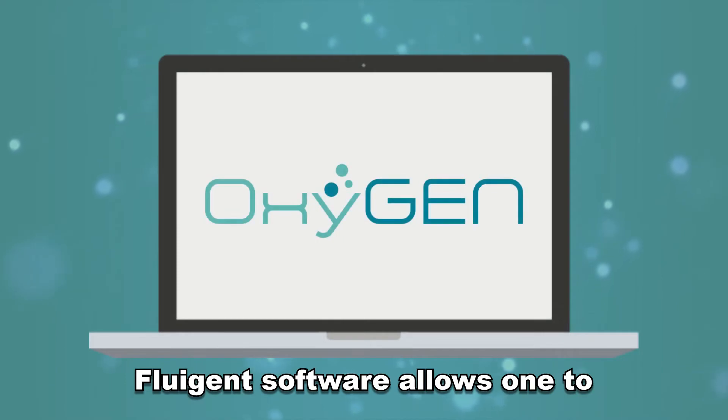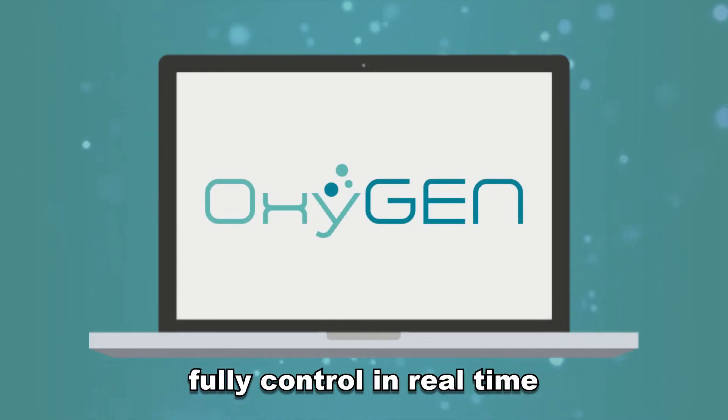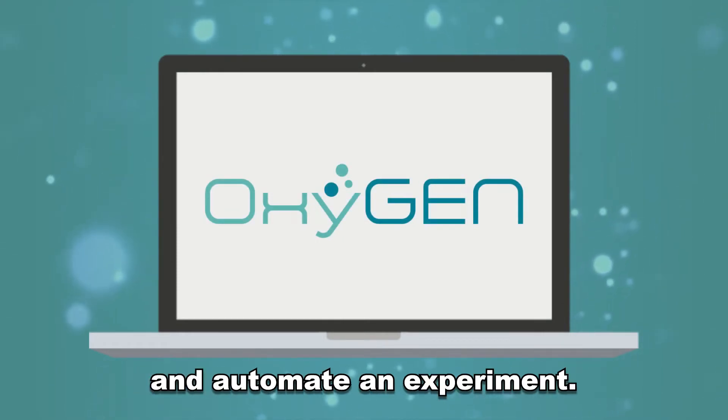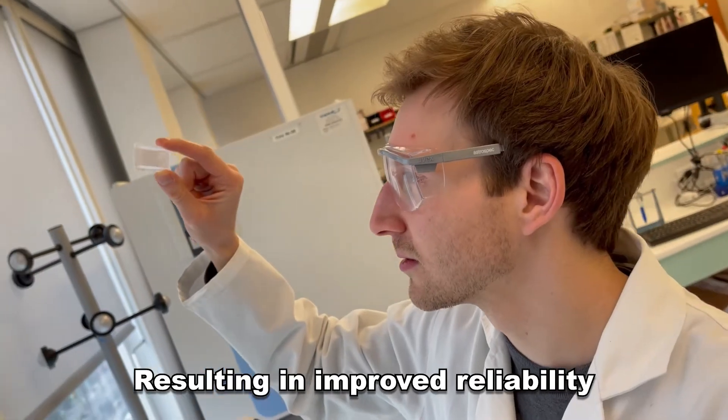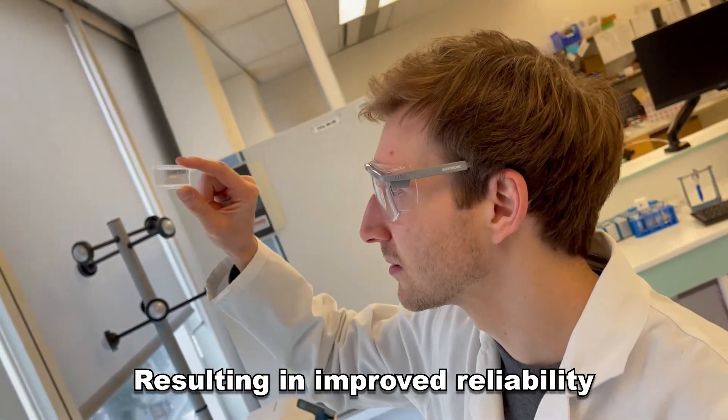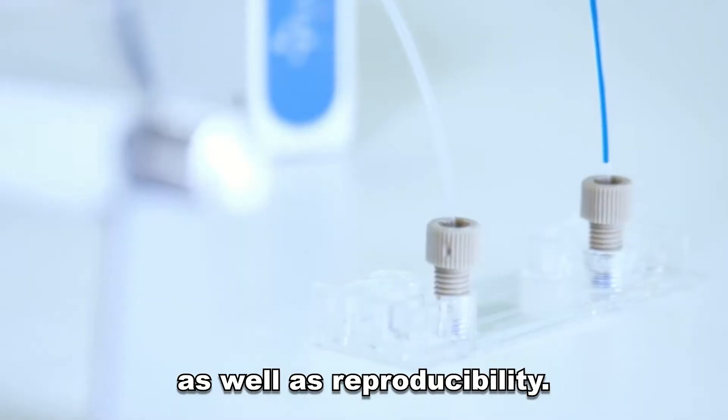Meet Oxygen. Oxygen software allows one to fully control in real time and automate an experiment, resulting in improved reliability as well as reproducibility.